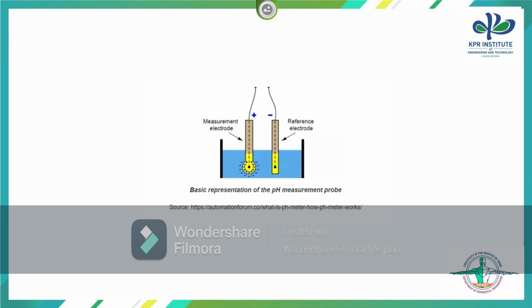In simple terms, pH is a numerical value which quantifies the acidity or basicity of a solution. The number represents the number of hydrogen ions a particular substance released in the solution. On the pH scale, a pH of 7 is considered to be neutral solution. A solution with pH 0 to 7 is considered to be acidic, and above 7 till 14 is said to be a basic solution.